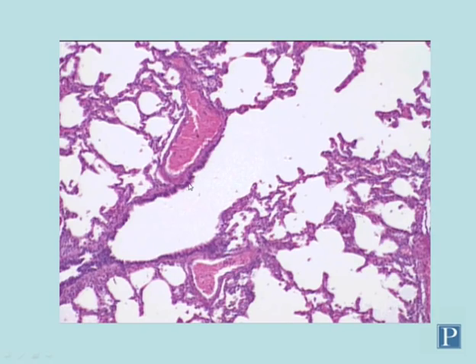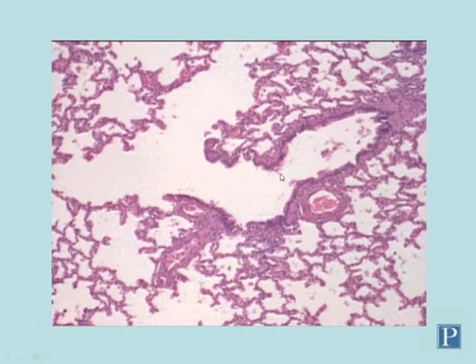Another difference between a terminal bronchiole and a respiratory bronchiole is the epithelium. The epithelium of a terminal bronchiole is simple columnar, and you can see it flattens out becoming simple cuboidal in a respiratory bronchiole. Here's another terminal bronchiole with that thicker epithelium, branching off to form two respiratory bronchioles.